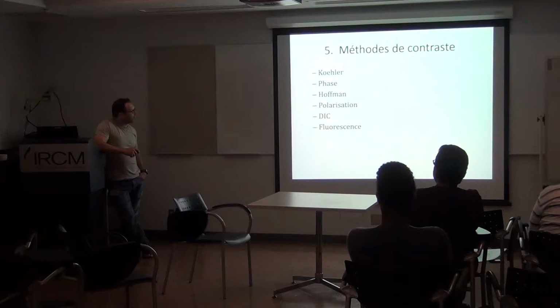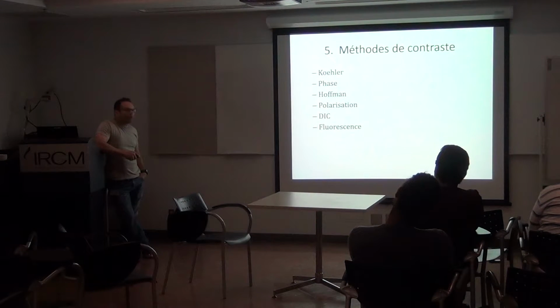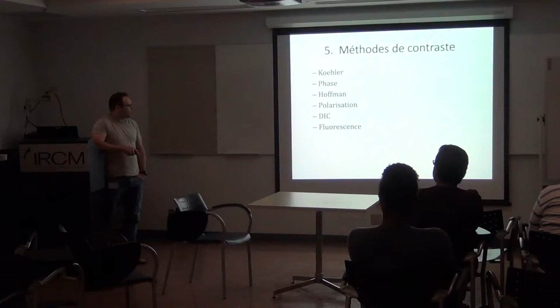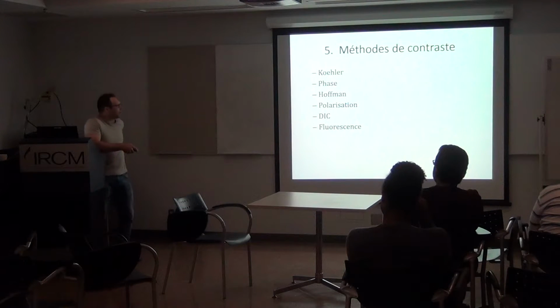they are used, and they are basically used for transmitted light, while this one is mostly for reflection. And this is the easiest one, and those ones are really more difficult to achieve. This is mainly because of it that it's widely used, I guess, because it's so easy. And it produces a really, really nice contrast, and it's impressive, it's good looking, and so on.